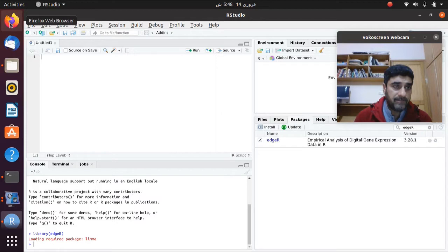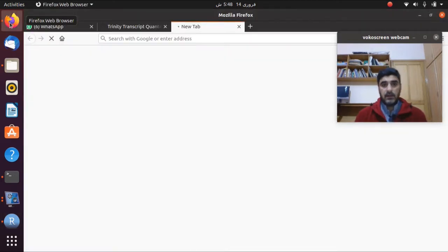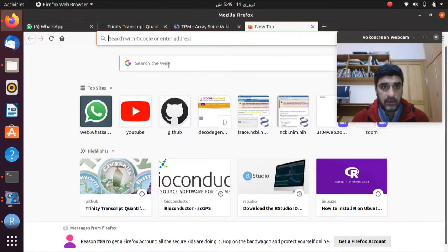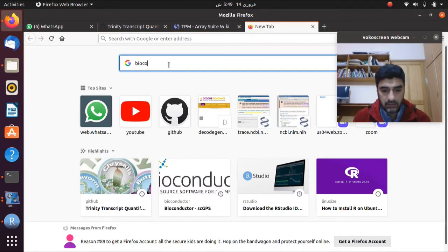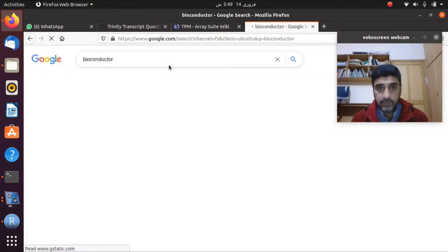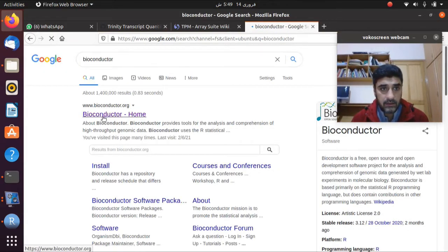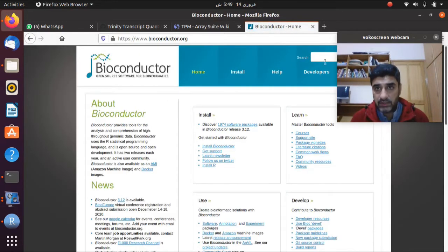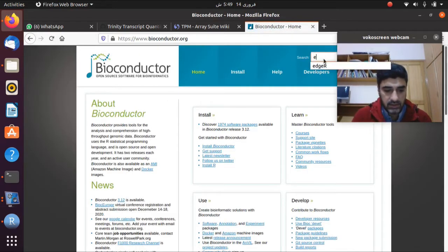Okay, if it is not here, you can install it from the Bioconductor website. So you will go to Bioconductor. Let me give you an overview again here. You will go to the Bioconductor website, and you will just write edgeR in the search, edgeR.